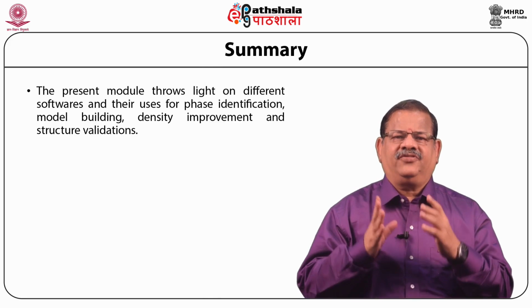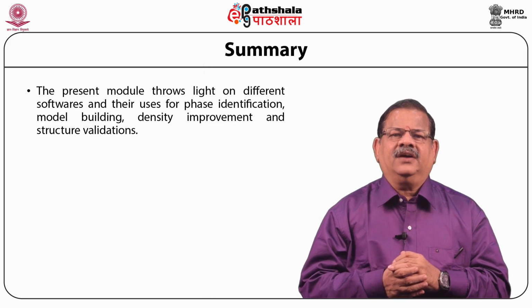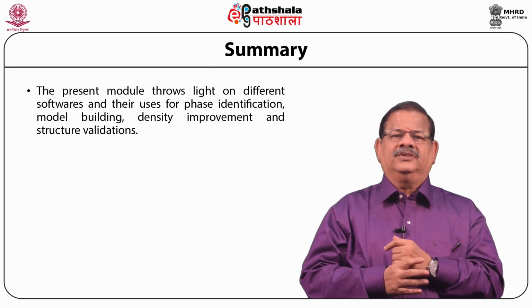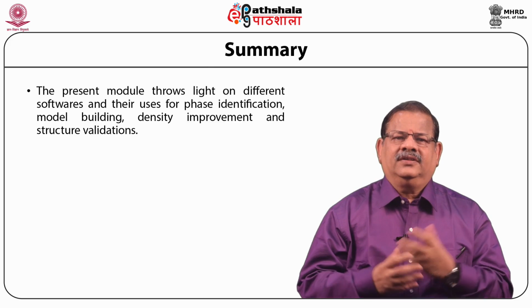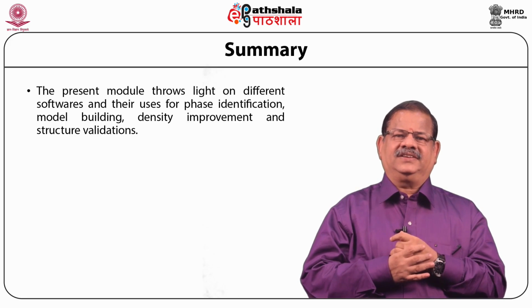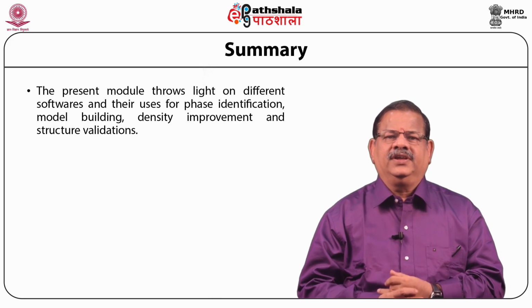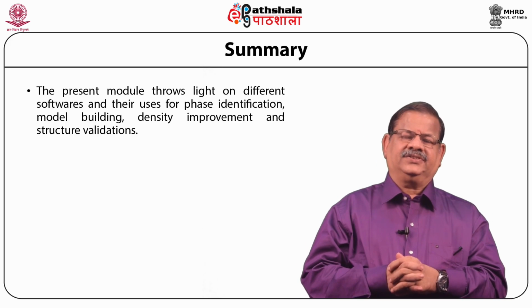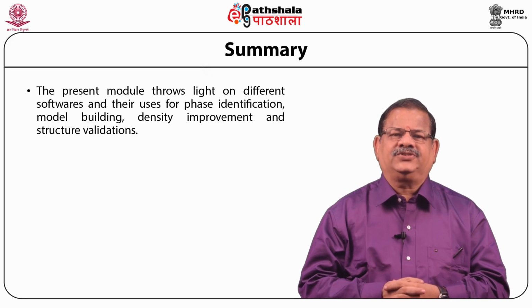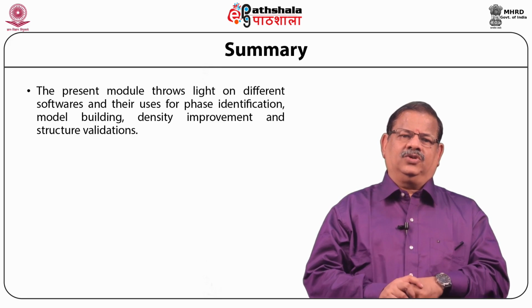And also we have seen 2 other packages. One is the Phenix suite of programs. In Phenix, there are two modules, solve and resolve. Solve uses the heavy atom positions located from the anomalous scattering data, and resolve uses them for phasing and doing your modeling business. So it is separately available, and also it is contained in the Phenix suite, which also has some other programs other than these modules.